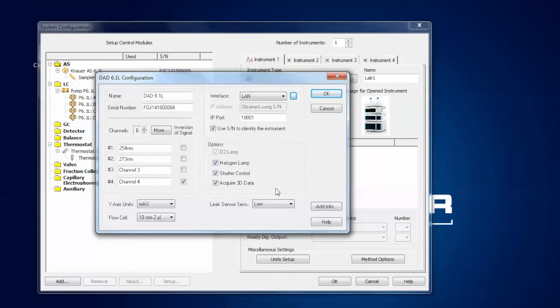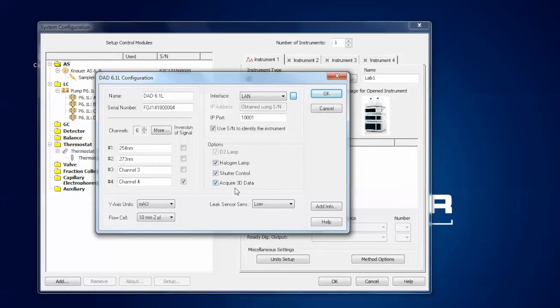There is a D2 lamp which you cannot switch off — it is always on. However, you can switch off the halogen lamp if you do not need the higher wavelength range. You can also deactivate the shutter control, but please do so only when our support team asks you to — otherwise leave the tick here. Finally, you can deactivate the 3D data option, but this is only necessary if you want to use the detector as a multi-wavelength detector rather than a PDA. If you want to use the PDA option, make sure you purchase the respective PDA license — otherwise an error message will pop up. The last thing is the leak sensor sensitivity, with options of low, medium and high. Once the DAD is configured, click OK to add it to the list.